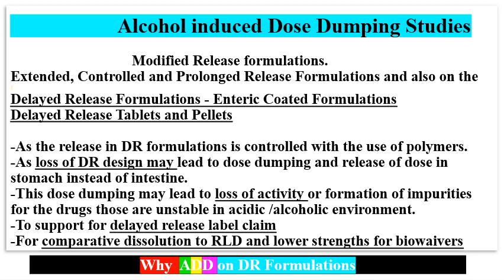Alcohol induced dose dumping is required for some modified formulations like extended release, controlled release, prolonged release, and also for delayed release or enteric coated formulations, as the release in DR formulations is controlled with the use of polymers. Loss of DR design may lead to dose dumping and release of the dose in the stomach instead of the intestine.